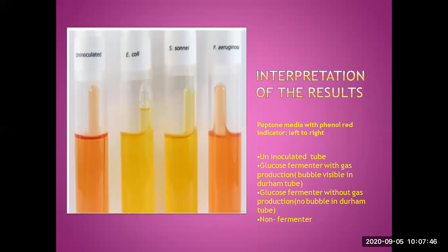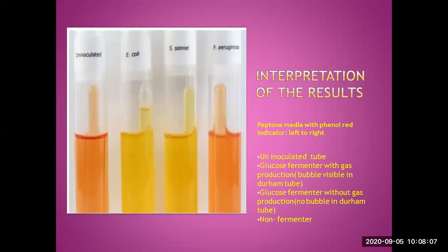If there is a bubble in the gas, it means that there is gas production. The second tube shows fermentation plus gas production. The third tube shows fermentation only. The first tube has no color changes and there is no gas production in it.